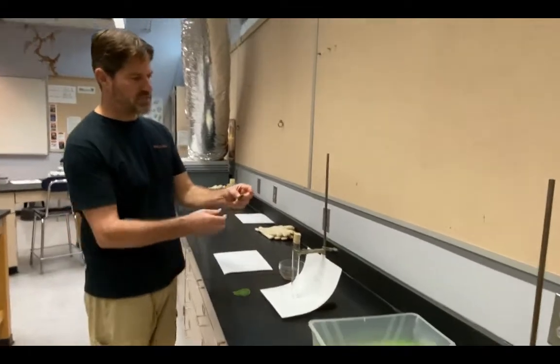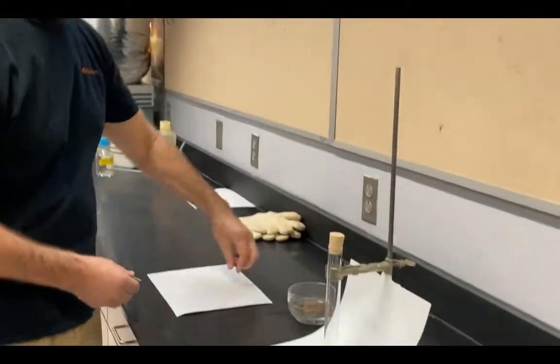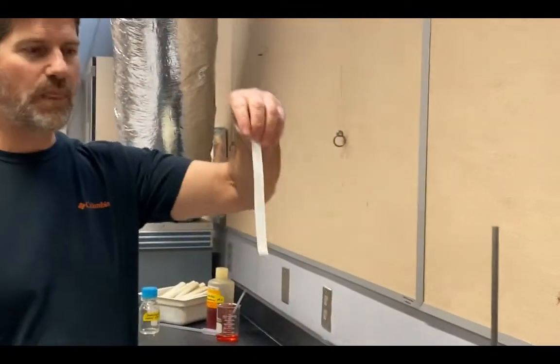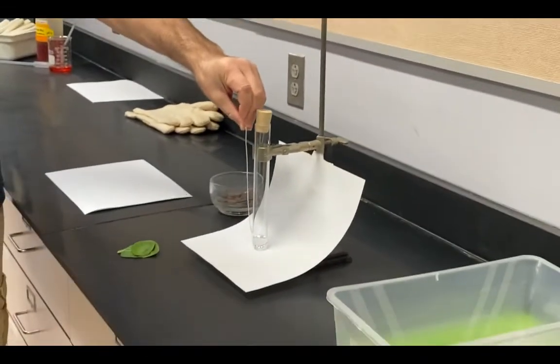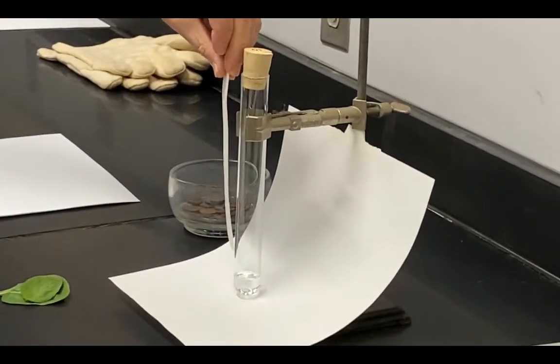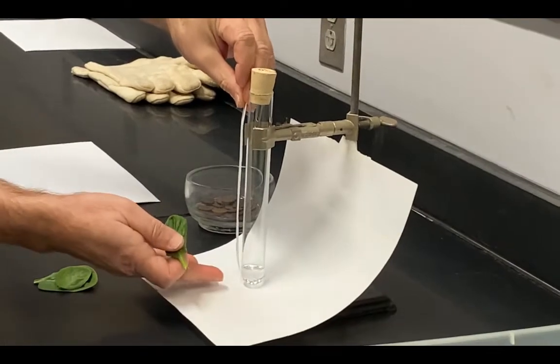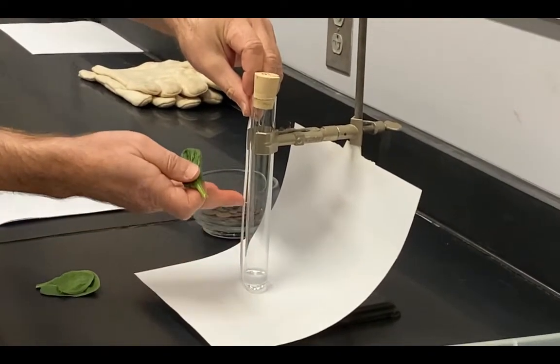So I have here a number of spinach leaves. I have some chromatography paper. I'm going to eventually place that in here and what we're going to do is we're going to have a solvent pick up the pigments and move them up the paper.